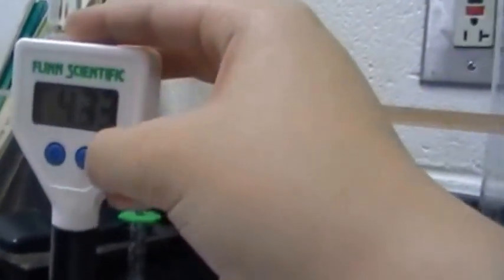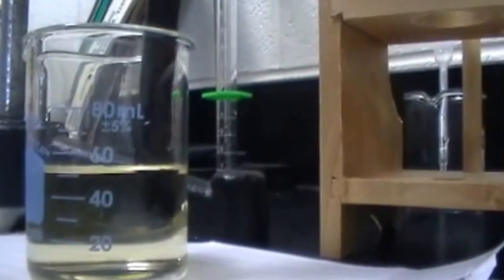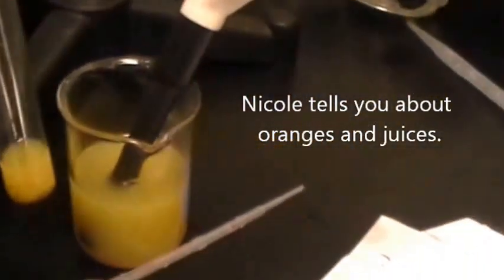So 4.33 — we stirred the whole time with the magnetic stirrer. After one drop it went to 4.33. Now we're checking to see if the color of the OJ from the original to what we're titrating is any different, to see if there's a base in it yet. But it doesn't seem to look like there's any difference.